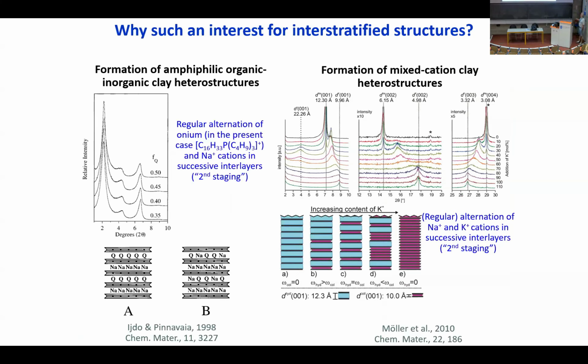It was shown, for example, for the interstratification of different inorganic interlayers in smectite, with alternation of expanded or hydrated interlayers containing essentially sodium and water to something that contains essentially potassium here. And at some point, you can see that we have a continuous change of position from those corresponding to pure dehydrated potassium to pure hydrated sodium.